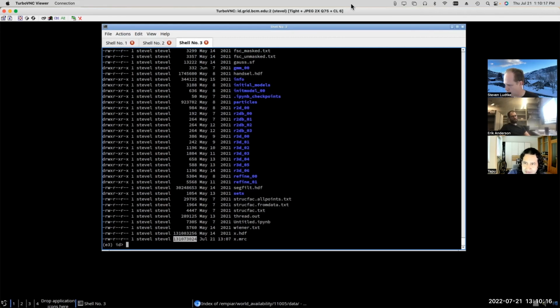Technically, there are sort of two related formats. There's the LST and there's the LSX. The LST file doesn't have fixed length lines, and the LSX file does have fixed length lines. So even if the line length isn't fixed, you can still read them. It just gets extremely slow because every image then has to seek to the correct point in the file. So basically they get temporarily written as LST files, and at the very end you make one pass through and renormalize them to the line lengths.